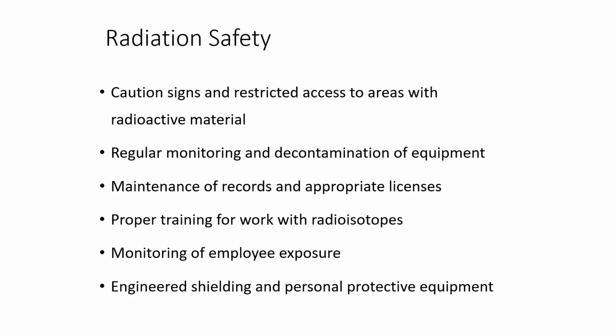Radiation safety. Caution signs and restricted access to areas with radioactive material, regular monitoring and decontamination of equipment, maintenance of records and appropriate licenses, proper training for work with radioisotopes, monitoring of employee exposure, and engineered shielding and personal protective equipment are necessary.